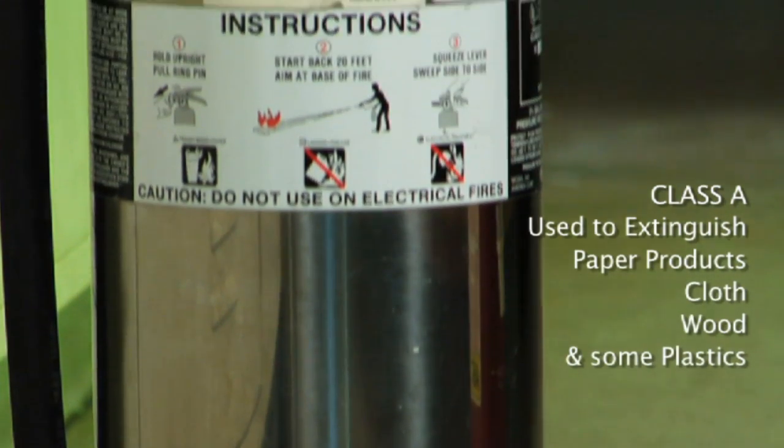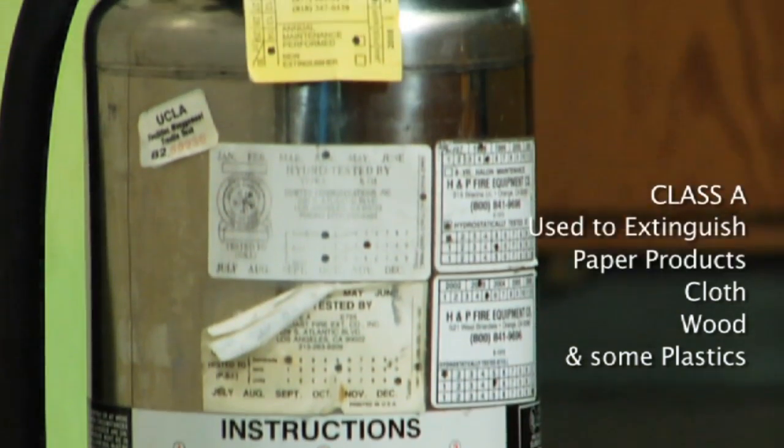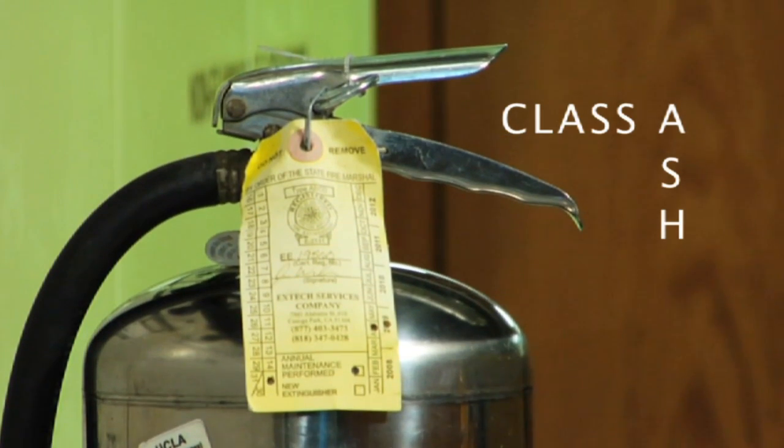Class A fire extinguishers are used to extinguish fires involving ordinary combustibles, such as paper products, cloth, wool, and some plastics. Some people find it helpful to remember Class A fires produce ash.